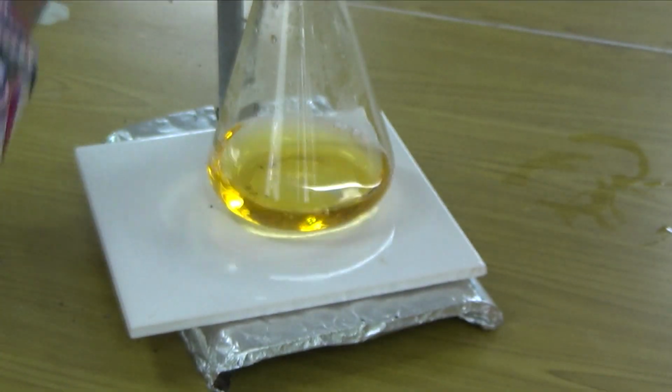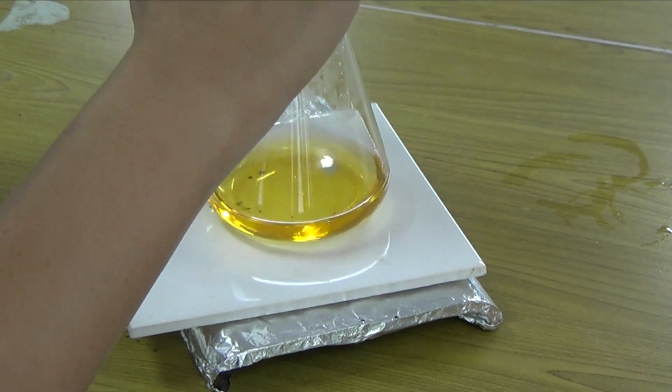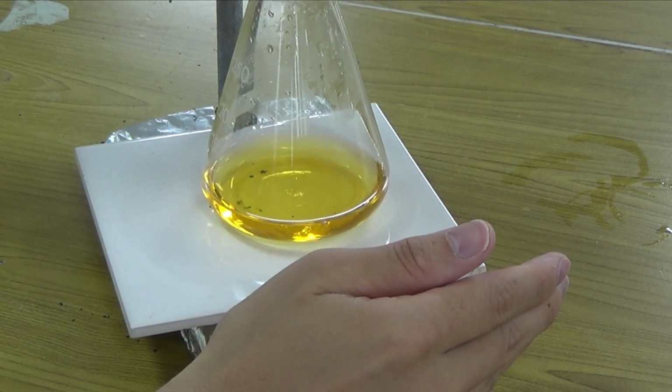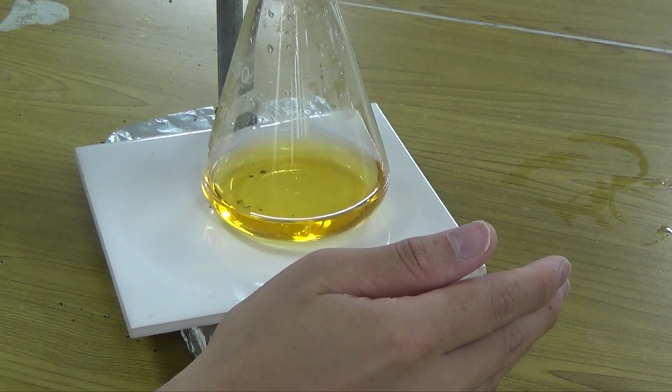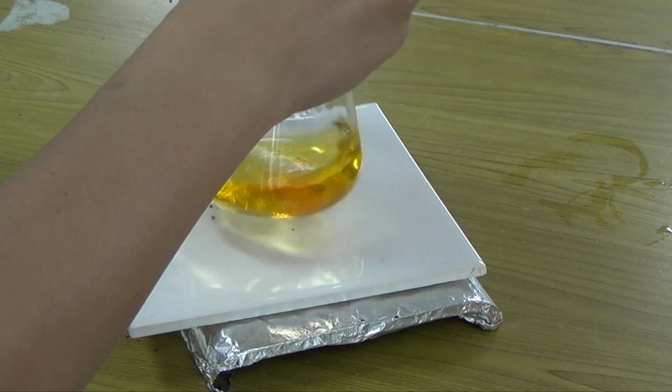Now I'm going to do drop by drop. We need to be very careful here because I'm very, very close to the endpoint, so I cannot overshoot this. Otherwise, I'll be wasting my time. I need to go slow and get it right. Okay, hang on, not yet. Yep, so that is drop by drop.